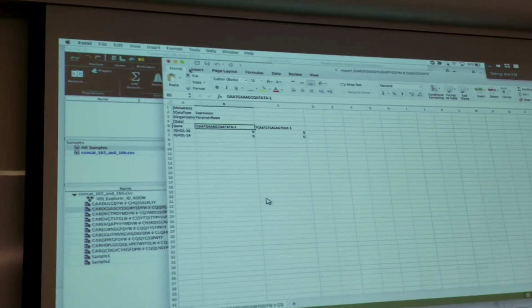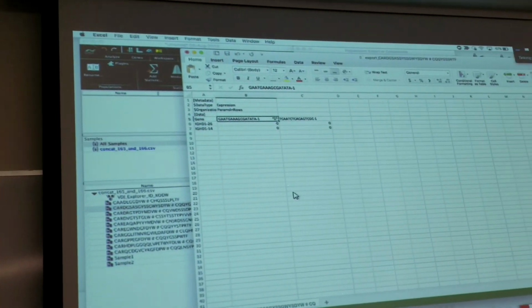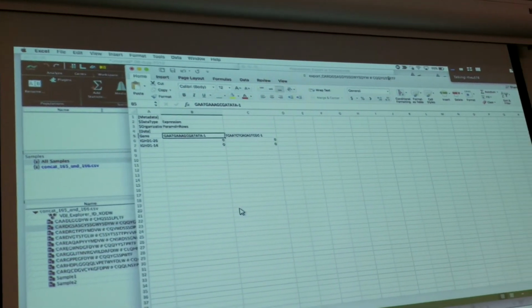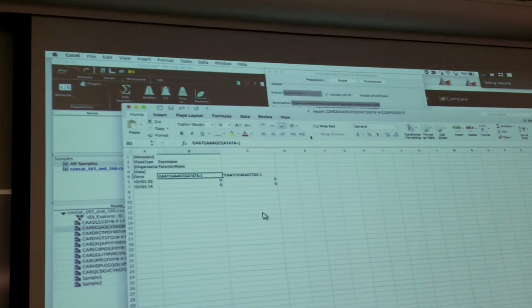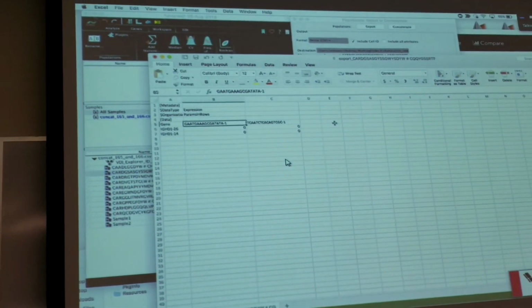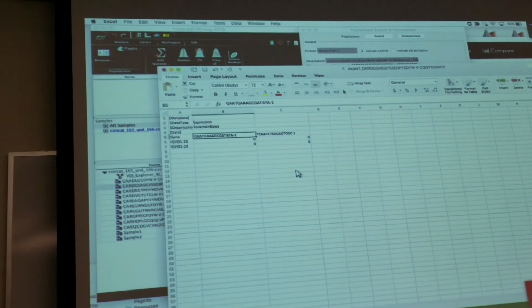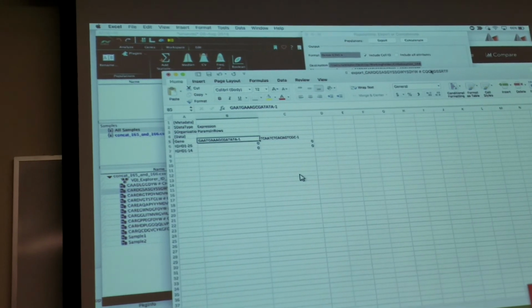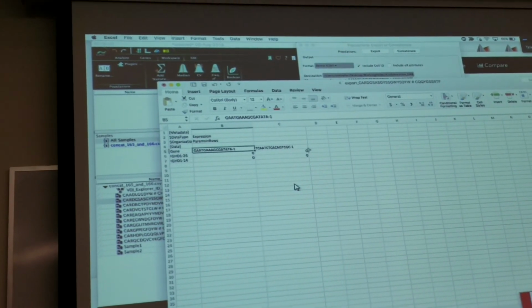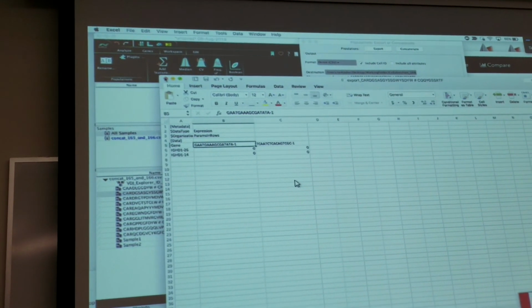And like that cell, the first cell barcode, then go back to the FASTQ file and ask what is that heavy and light chain sequence. I don't know how to ask that. I'm not sure either, and we don't deal with those FASTQ files yet. It's interesting because I'm sure other people will be asking the same kind of question. And then obviously these are the amino acids associated with heavy and light chain. Yeah, with the CDR3.